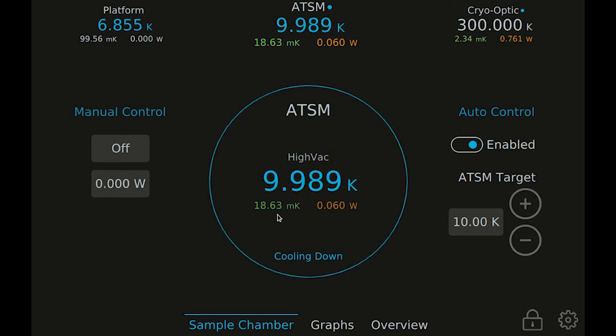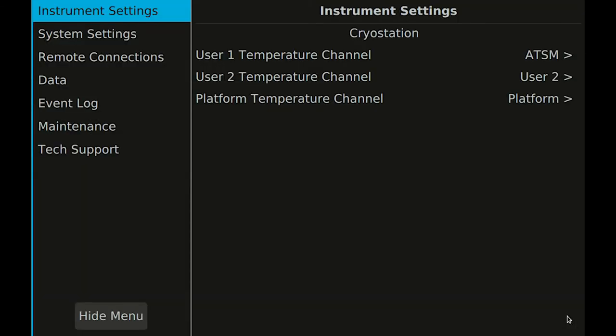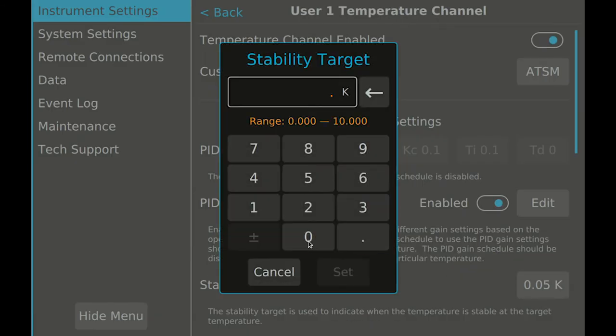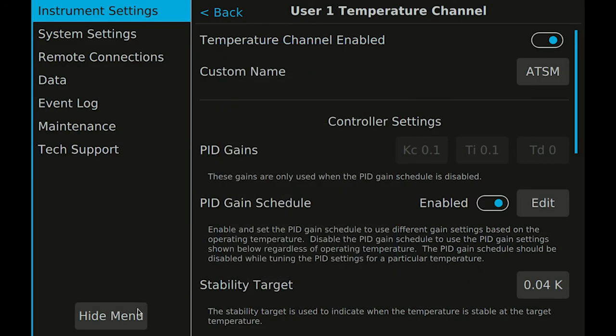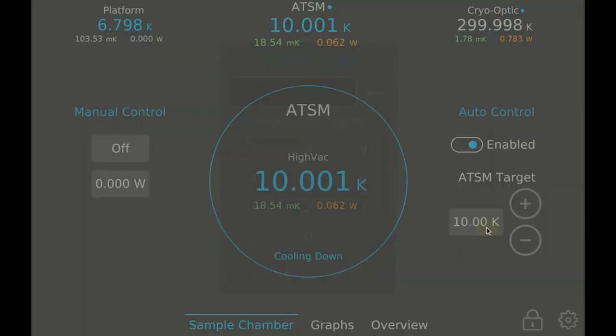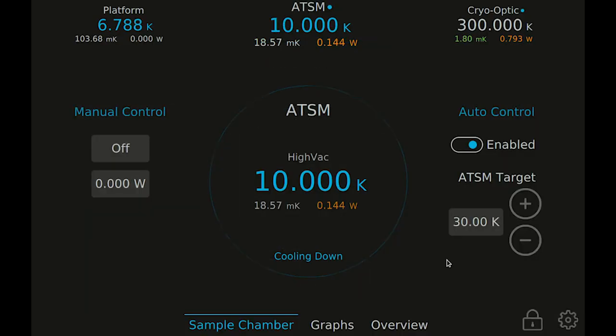The temperature stability indicator will turn green when the temperature is stabilized at the target temperature. The threshold used to determine whether the temperature has stabilized can be customized in the instrument settings. You can change the ATSM target temperature to move to different temperatures in the temperature range. Watch the stability turn green as the temperature locks in on the target.